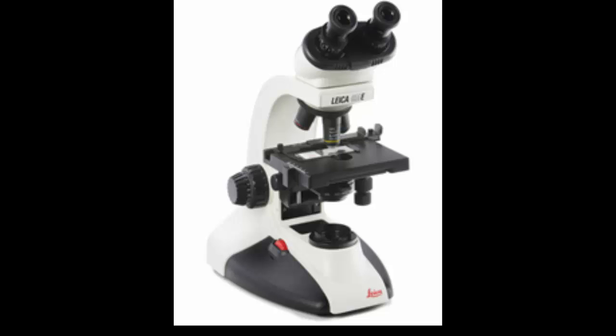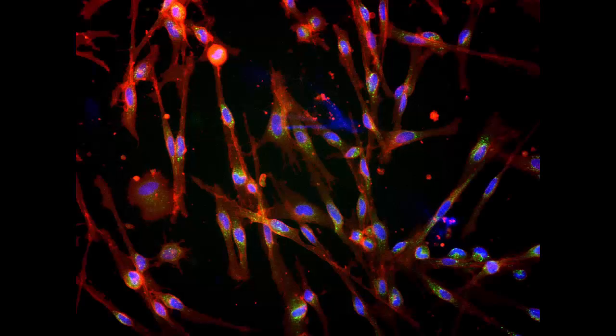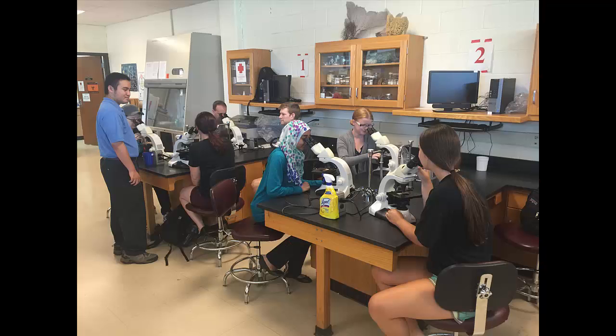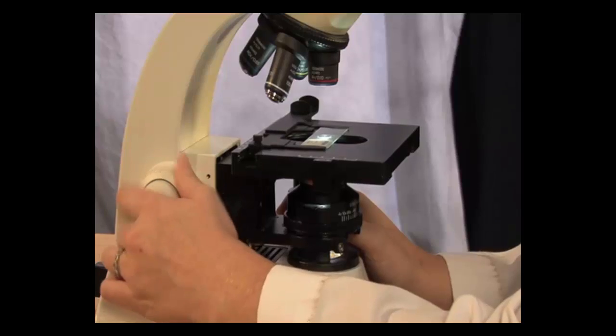Many laboratories here at Wake Tech use a light microscope. These microscopes can magnify up to a thousand times and are perfect for our student laboratories. But before you can use a microscope, you need to know a little bit about the parts of the microscope.